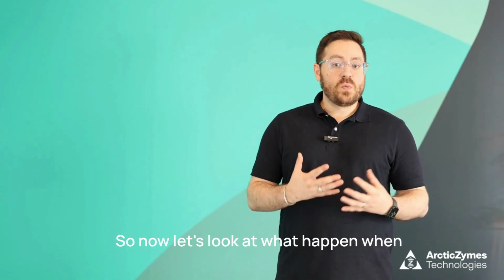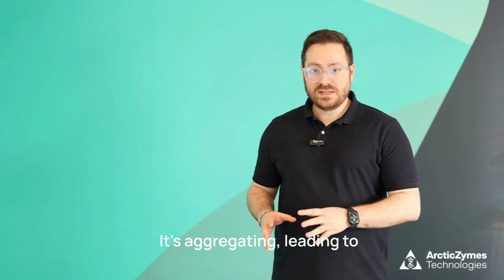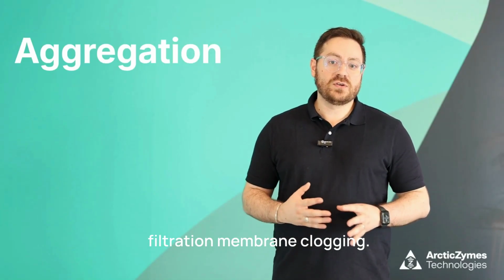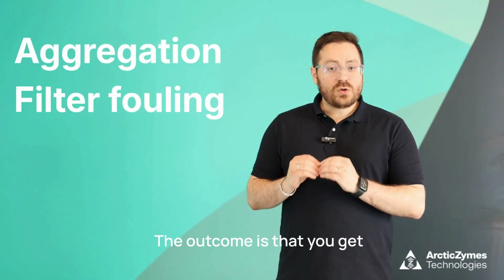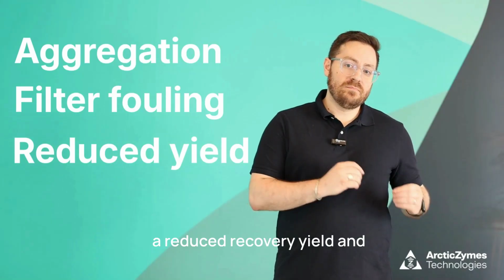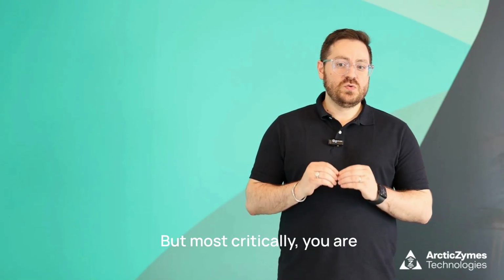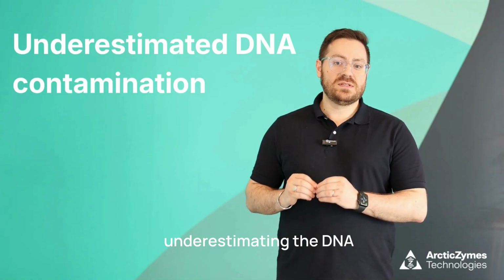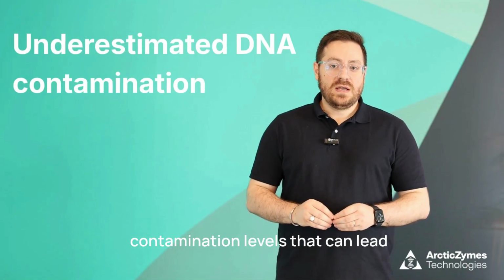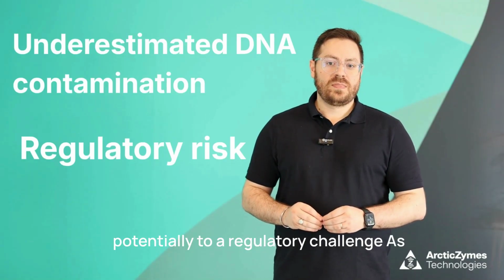So now let's look at what happens when chromatin isn't properly digested. It's aggregating, leading to filtration membrane clogging. The outcome is that you get a reduced recovery yield and batch-to-batch variability. But most critically, you are underestimating the DNA contamination levels. That can lead potentially to a regulatory challenge.